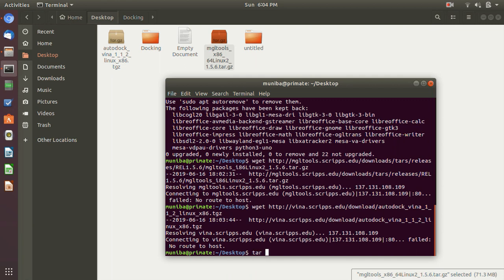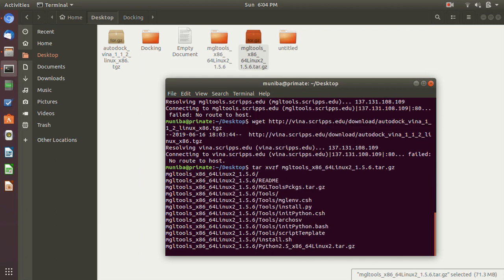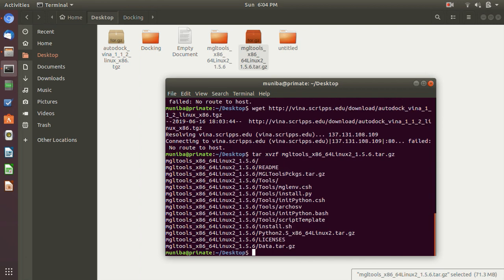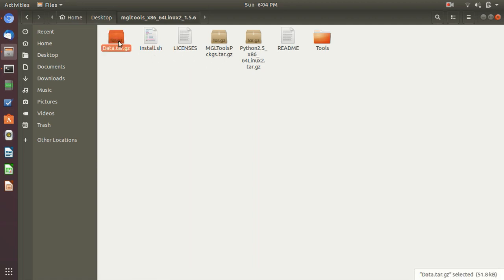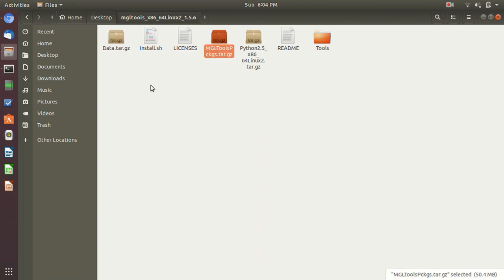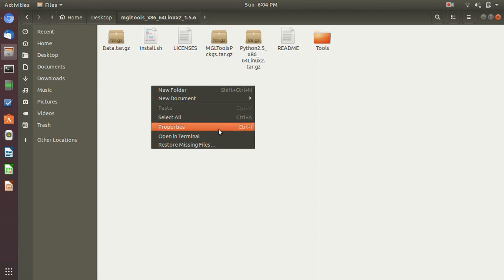Okay, first we will untar this: tar xvzf mgltools. Okay, as you can see, there is a new folder here. This is MGL Tools. You can untar this also. It will show you the docs and some examples also, and this one too.